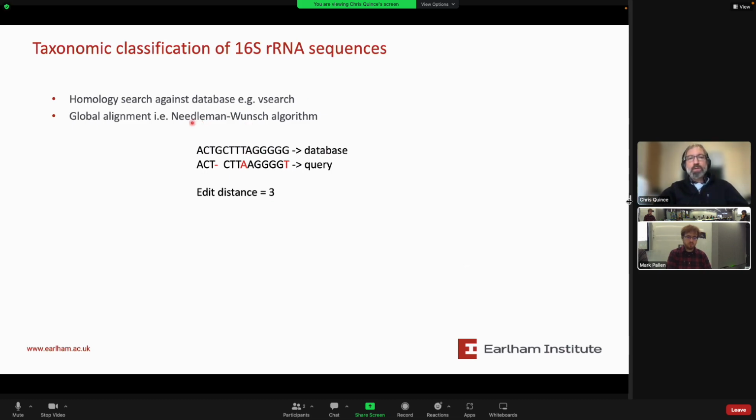All right. So there is actually a perfect algorithm for doing global alignment. That's the Needleman-Wunsch. Unfortunately, it's rather slow. So typically, in practice, what you'll be doing in terms of this bioinformatics is a fast method for getting an approximate match, and then you might be doing slow Needleman-Wunsch on all those approximate matches to get the ideal alignment of your query sequence against the database.